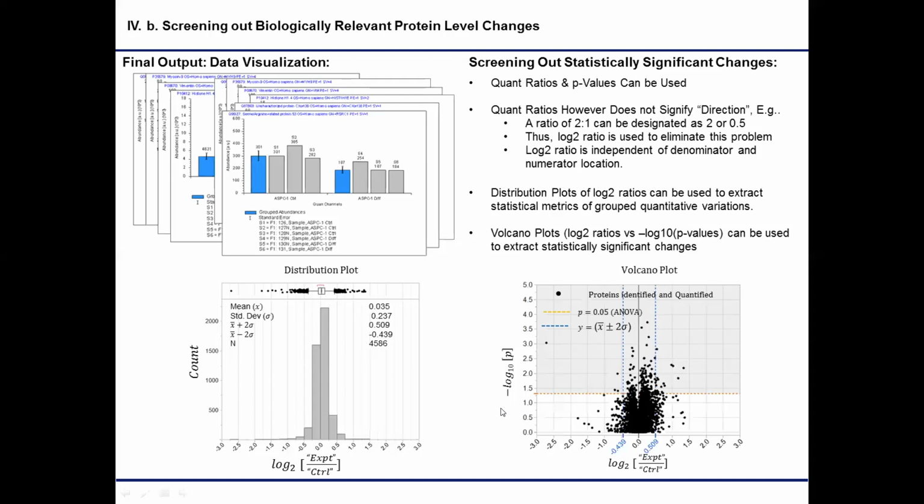If you're looking at the identification of a mutation, you may have a mutation that changes an amino acid in a protein, but whether or not that's biologically significant is a very difficult question to answer. You can say statistically that you have a change that is significant based on the rest of the population of the data, and that's what we're describing here.